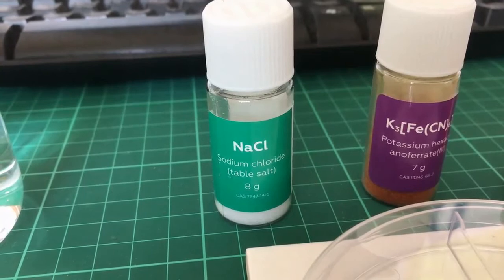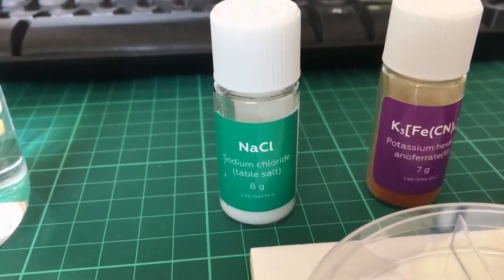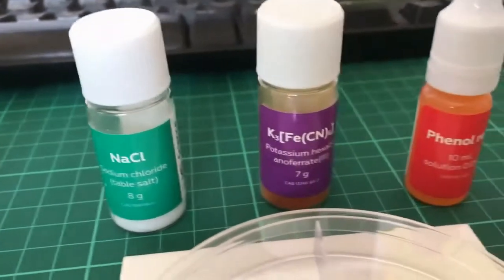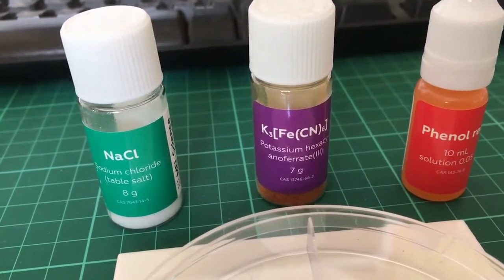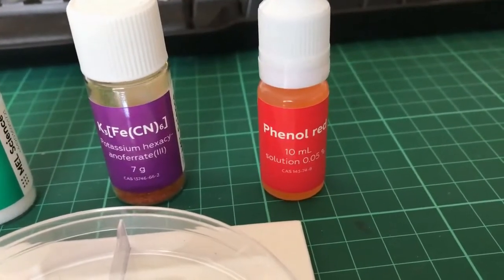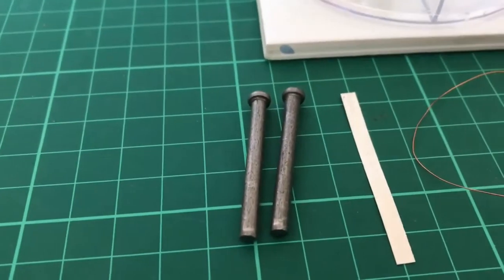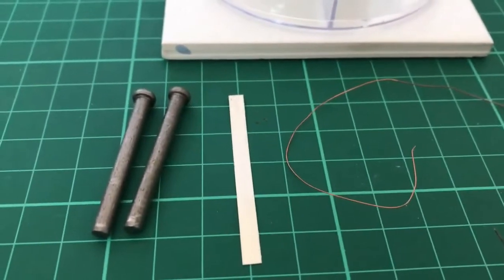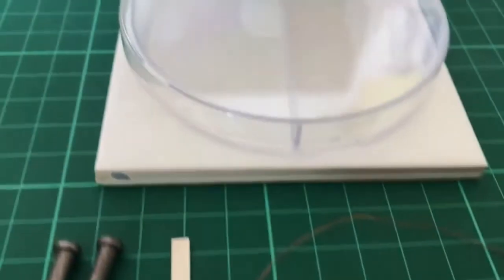For this experiment, you will need sodium chloride, potassium hexacyanoferrate, phenol red, two iron nails, a magnesium strip, copper wire, and a petri dish.